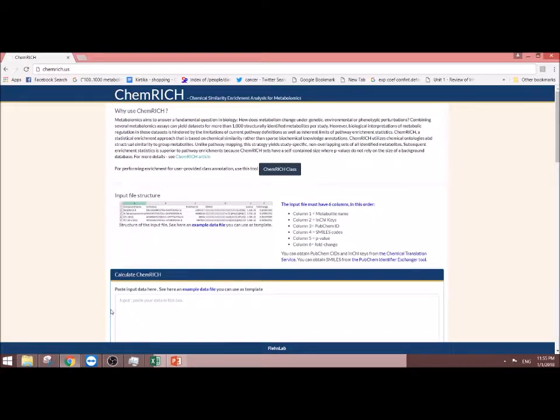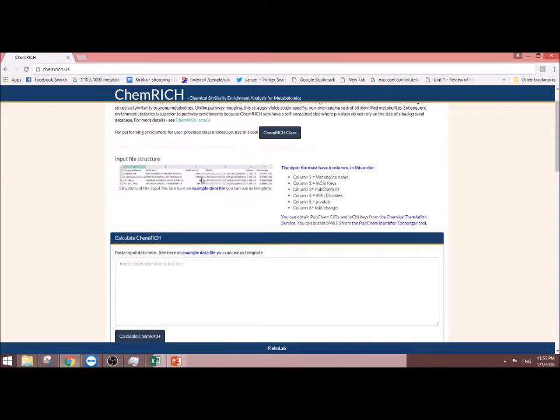In this video, I want to show you how you get various database identifiers for your metabolite lists. I want to show you a service offered by the PubChem database. It's known as the PubChem Identifier Exchange Service.